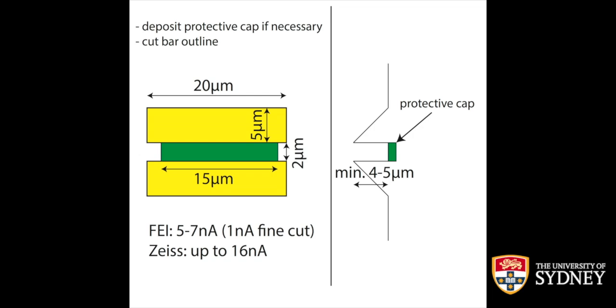As long as you entirely remove the film that you've put down, it doesn't actually matter very much. The only thing is that you want it to be as fine crystalline or even amorphous as possible, simply because then you get less milling effects from the crystallinity of your deposit.